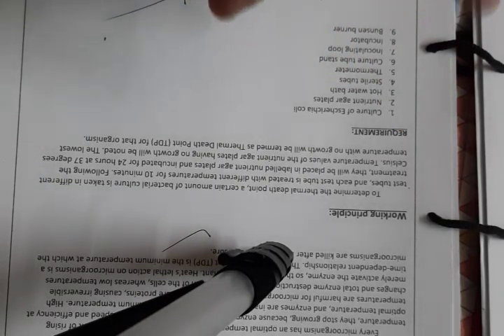So first of all, what do we need? Let's start from the beginning of the requirements. At first we need the bacterial culture, then we need a test tube, and using the test tube, we need to give it a hot water bath. So we need the hot water bath, we need a thermometer to measure the temperatures, and then we need agar plates, petri dishes, with the nutrient agar. And that is the nutrient agar plate.